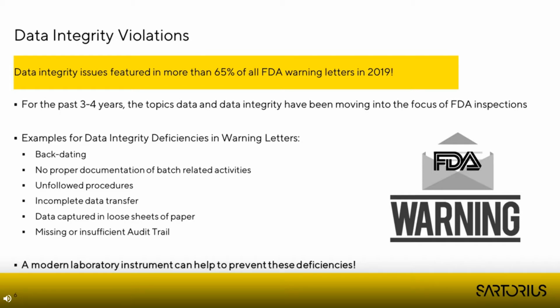For example, the instrument did not have an audit trail, the audit trail was deactivated, or simply the audit trail entries were not reviewed. I will show examples of this later, and also how digitalization and a modern laboratory instrument effectively prevent these issues. You should also always keep in mind that data integrity is not only relevant for electronic data. Paper-based records are also subject to the same requirements, but often a good and well-planned digital approach is safer and more efficient in the everyday laboratory life.